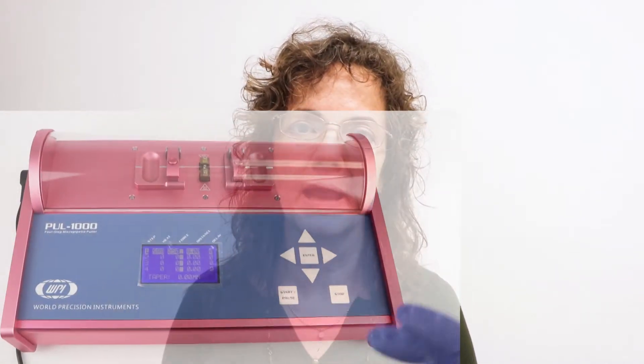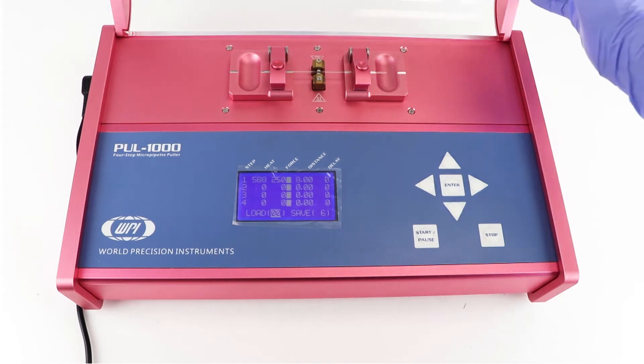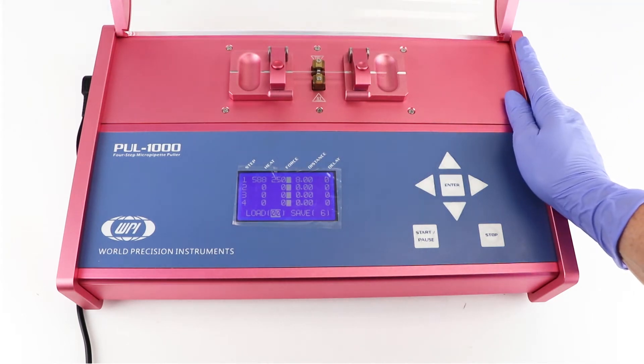The Pull 1000 is a four-stage microprocessor controlled horizontal puller designed for making micropipettes and micro electrodes, which are commonly used in intracellular recording, patch clamp, micro perfusion, and micro ejection.